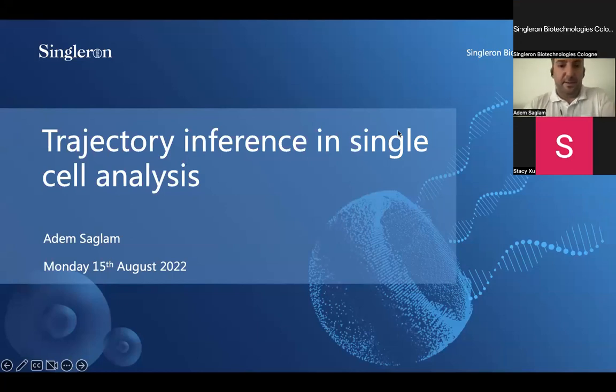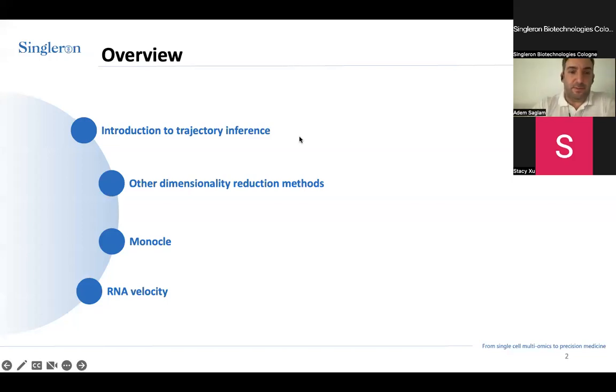So welcome to this webinar series. This is the fourth one about the trajectory inference in single cell analysis. So today I'm going to talk about what trajectory inference is and when it is useful.